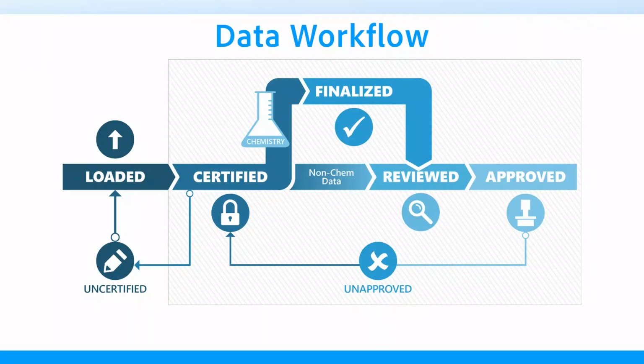It is recommended to start loading lab data as soon as it is available, and complete loading within 21 days after the end of sampling. As soon as the laboratory certifies their EDD file, our built-in automated data review processor will automatically begin applying qualifiers. Validators can review, revise, and finalize these qualifiers directly within the interface. Validation should be completed within 42 days of the end of sampling.